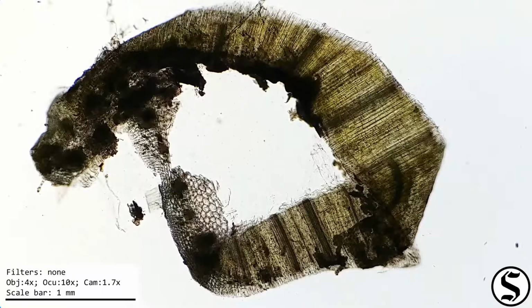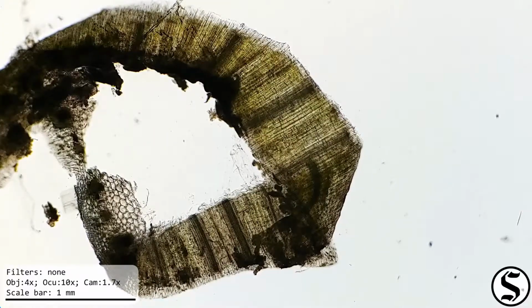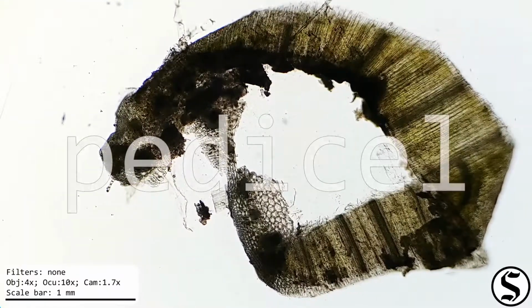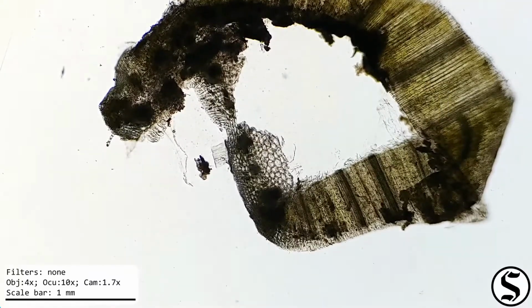Oh, it looks like it folded over. Well, even better. Now we can investigate it from two angles. We can look at it from the outside and as a cross section. So, like I said, this is the pedicel of the flower, and that comes from the Latin pedis, for foot.